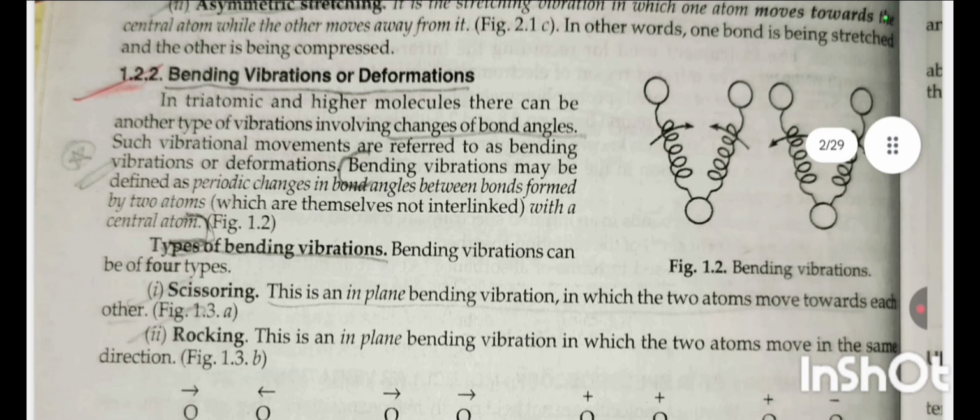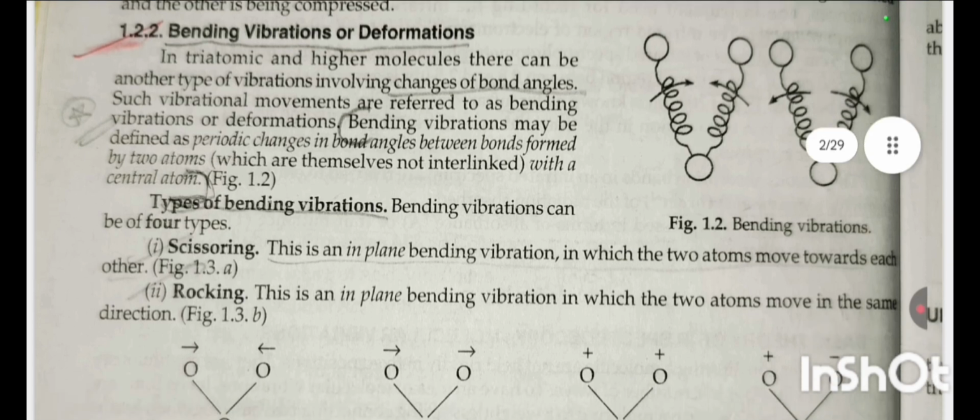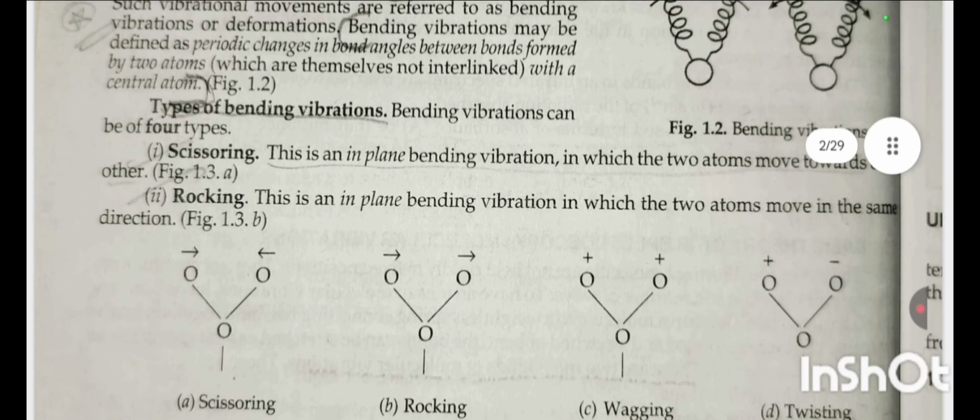Bending vibrations or deformations. In triatomic and higher molecules, there can be another type of vibration involving changes of bond angles. Such vibrational movements are referred to as bending vibration or deformations. Bending vibrations may be defined as the periodic changes in bond angles between bonds formed by two atoms with the central atom. Types of bending vibration. Bending vibration can be of four types.